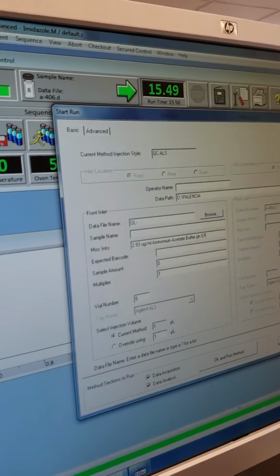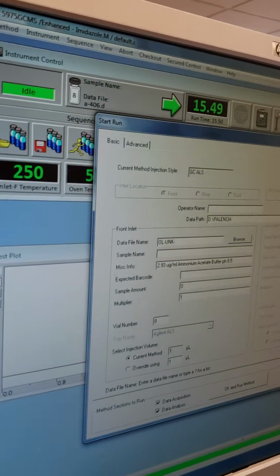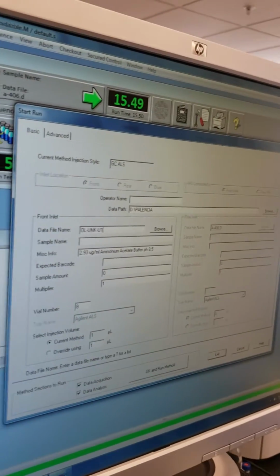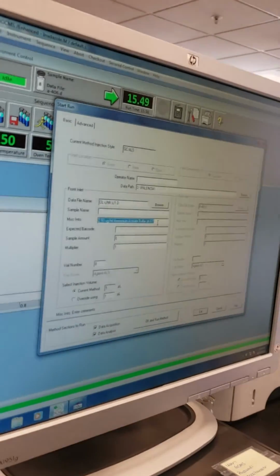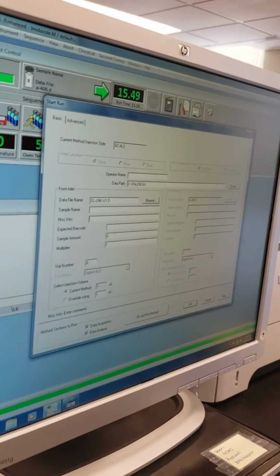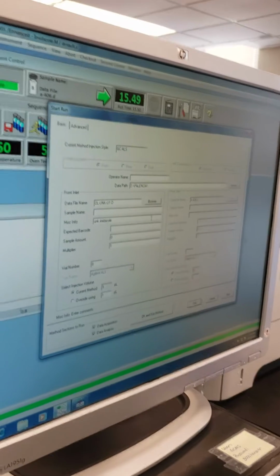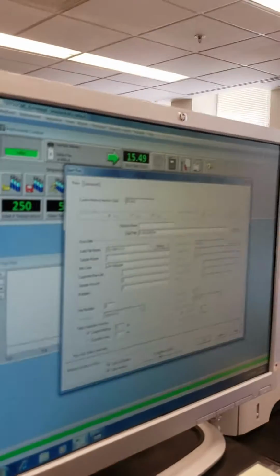That way I would know who was on this one. Okay. One? 1B? Yes. Like that. If you want to put any information about the sample or anything like that, you can do that here. Unknown. With a salt unknown. And it's probably good and okay to run the method.